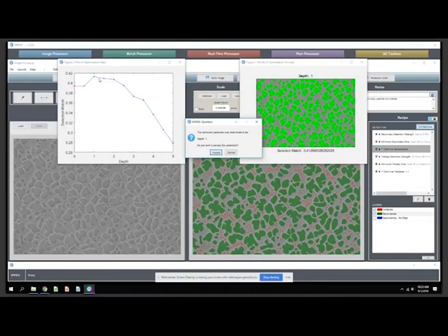And again, this is something that repeats on every image. So if there are changes from image to image that need accommodation, this can often accommodate them. Maybe the next image, for whatever reason, the imaging conditions were different and needed to use a depth of 2. It's going to choose 2, but it's going to choose 2 based on this same mathematical criteria.